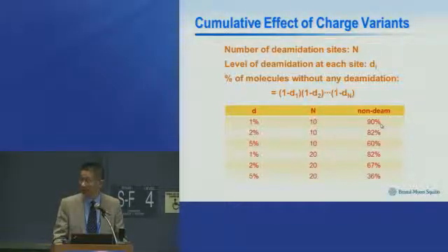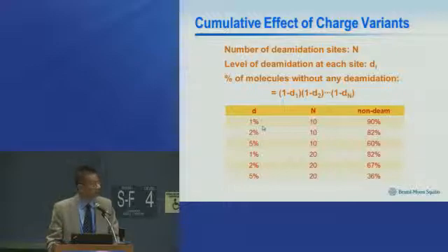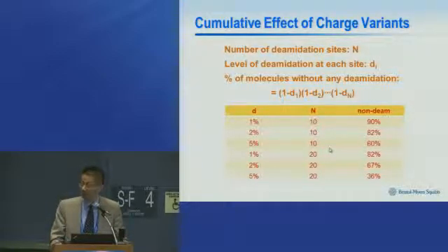That can be picked up pretty easily by chromatography techniques. But by peptide mapping, if you look at individual variants at 1%, it's almost impossible to do. If you have a higher level, for example 2%, that is very obvious. But a 2% change by peptide mapping is still very difficult.